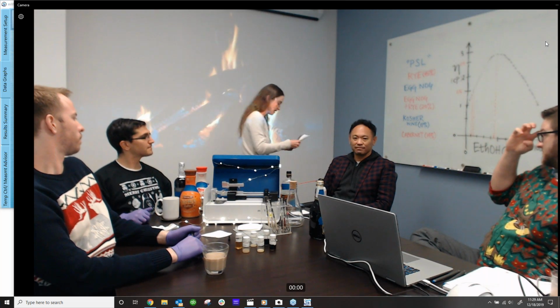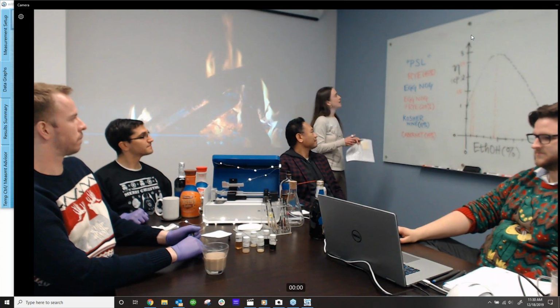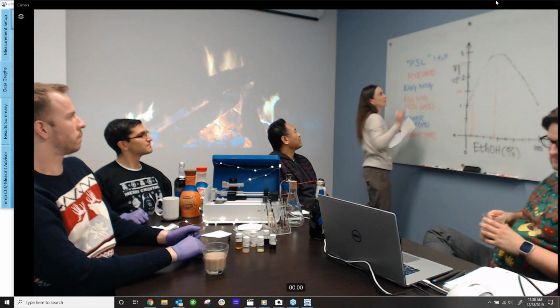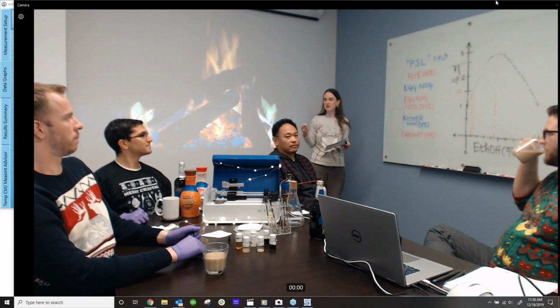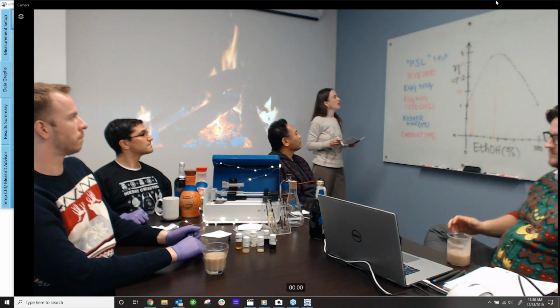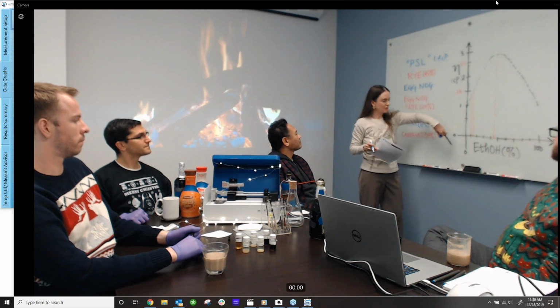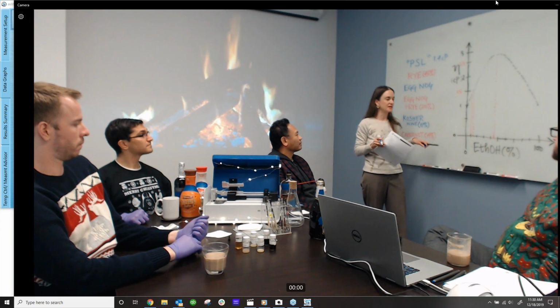So I jotted some of the information down as everyone was collecting the data. The pumpkin spice latte kind of stands on its own at about 1.4 centipoise. So that's probably reasonable. It's predominantly water with probably a tiny bit of thickener and some flavorings. That makes sense. So now when we move into the drinks with alcohol, I sort of quickly sketched out a plot here that we're going to refer to. This is viscosity as a function of percent ethanol content.